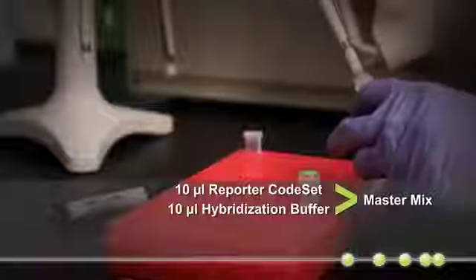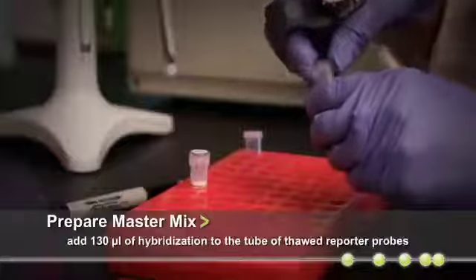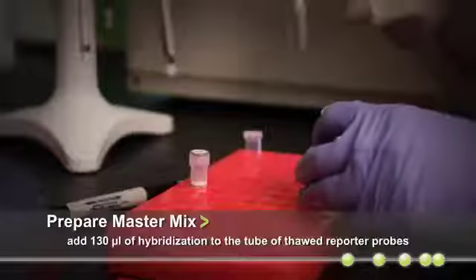However, we will use a master mix of reporter probes and hybridization buffer to eliminate pipetting variabilities. To set up this master mix, add 130 microliters of hybridization buffer to the thawed tube of reporter probes.